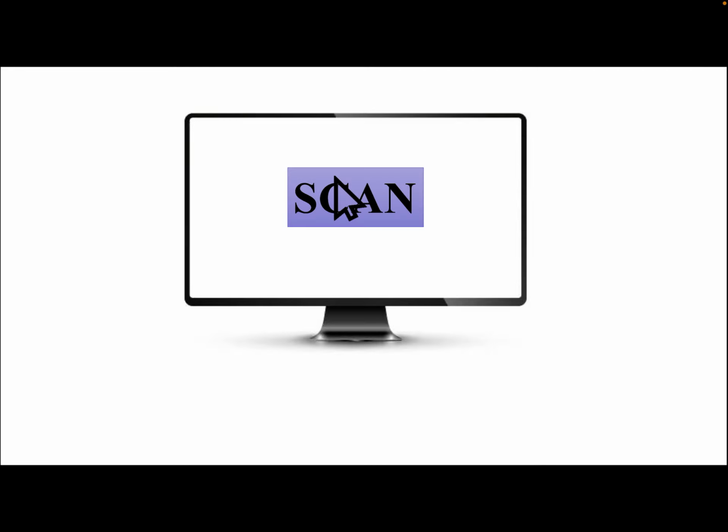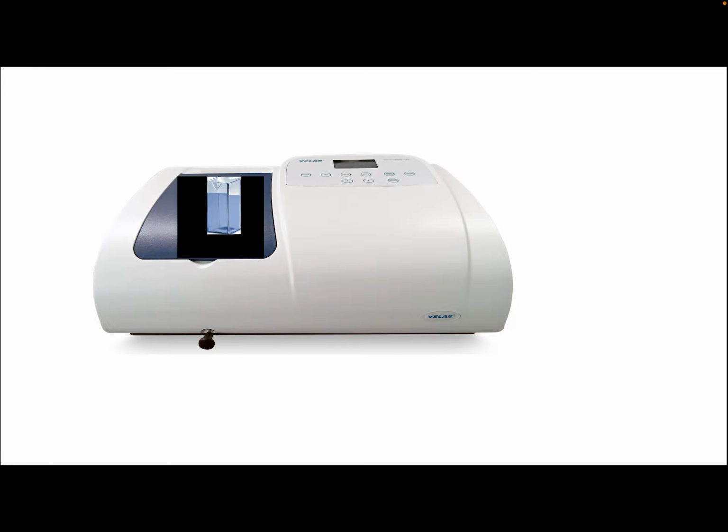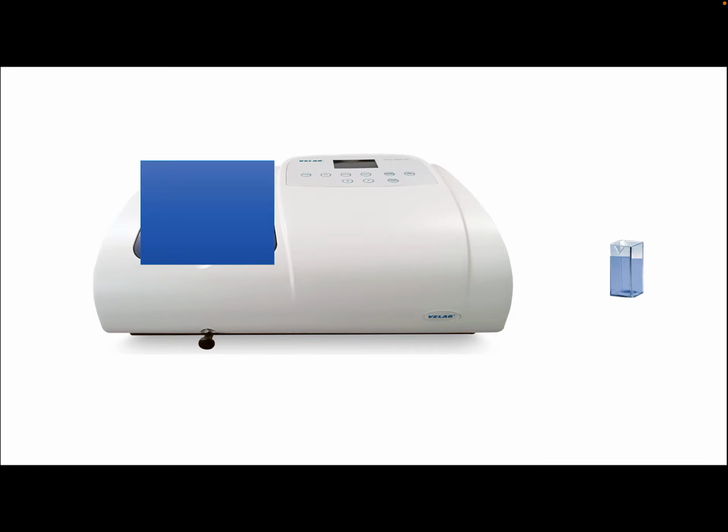And then once you're done scanning, you're going to go back to the spectrophotometer, open it up, remove your sample, and then you're going to close it back, and it needs to be closed at all times if you're not using it to take a sample in or put a sample out.